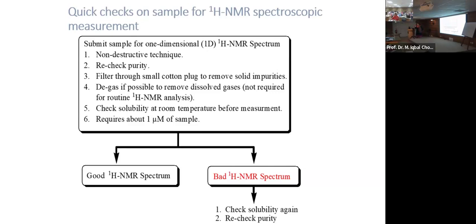These are the practical aspects. For example, the room temperature is 298 Kelvin. In NMR, we discuss everything in Kelvins, not centigrade. So 298 is 25 degrees Celsius. If you want to decrease the temperature, say to 273 Kelvin, you cannot immediately change from 298 to 273. You have to decrease slowly.